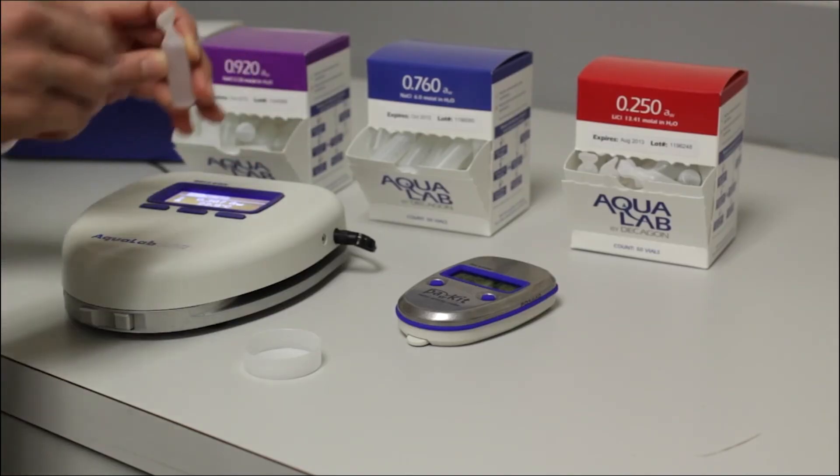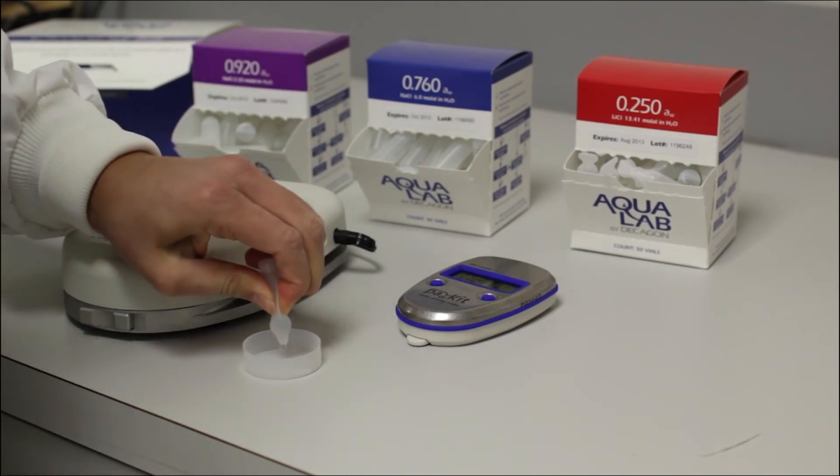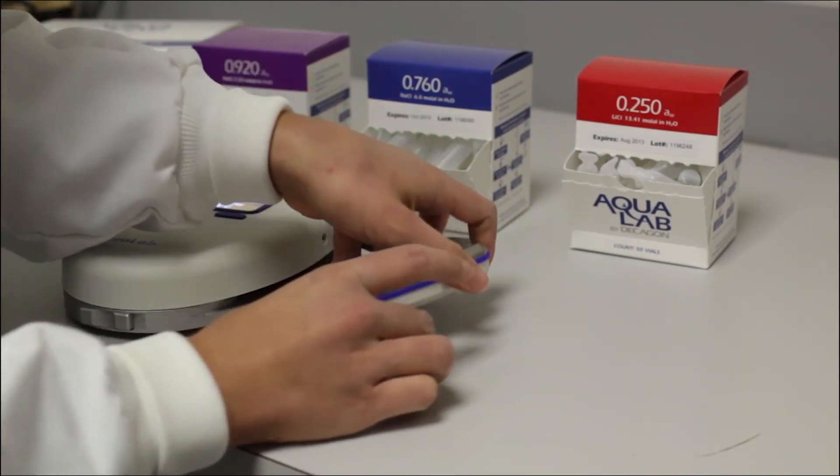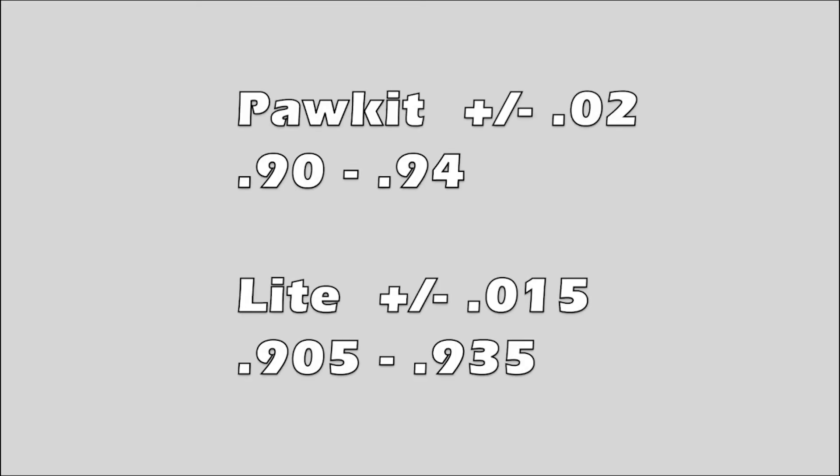Locate a vial of the second standard you are going to use, break open the vial, pour it into a sample cup, and if you are using the pocket, place the instrument above the sample to test. In this case, we use the .920 standard. If it measures anywhere between .90 and .94, then we know that it measured within spec because the accuracy of the pocket is to plus or minus .02.